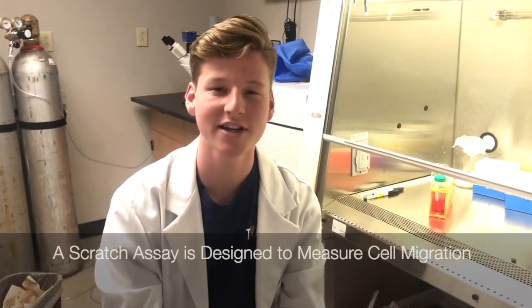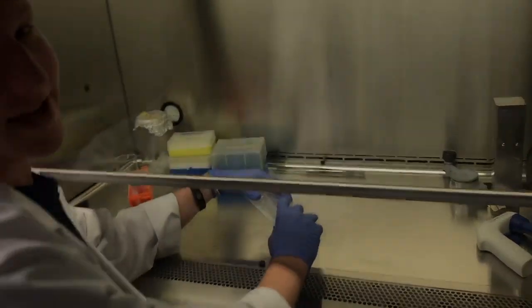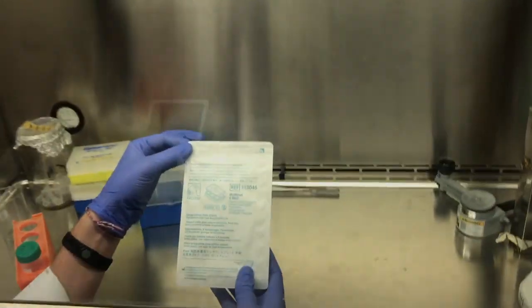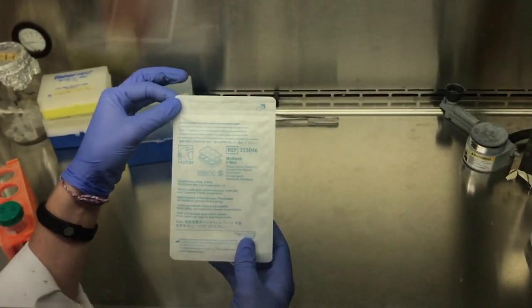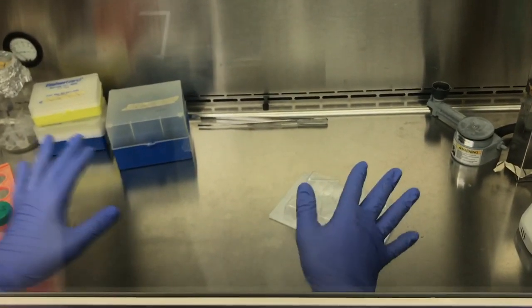Hey guys, today we're going to be doing a scratch assay, so go ahead and follow along. I will be doing this assay with a six-well culture treated well plate. Before you start, make sure everything is sterilized and good to go — I've already done that.